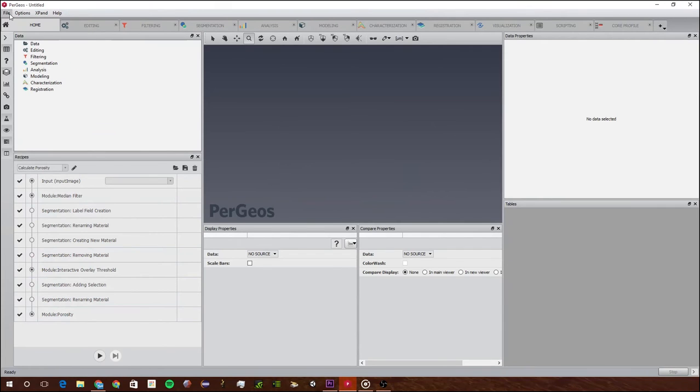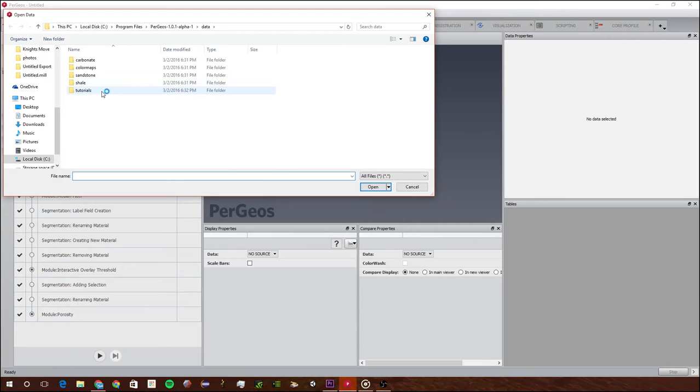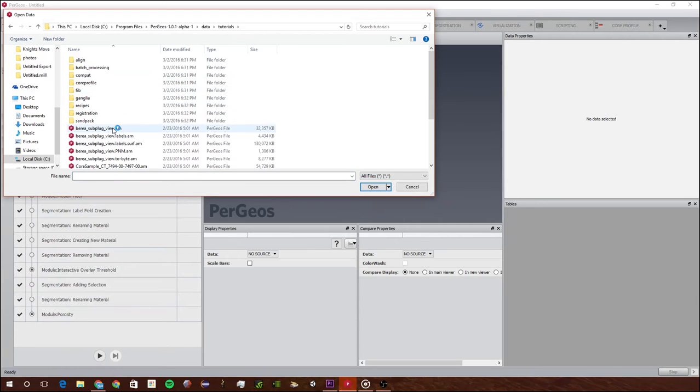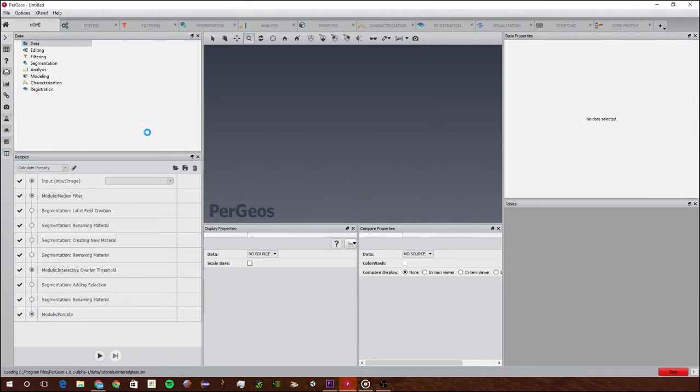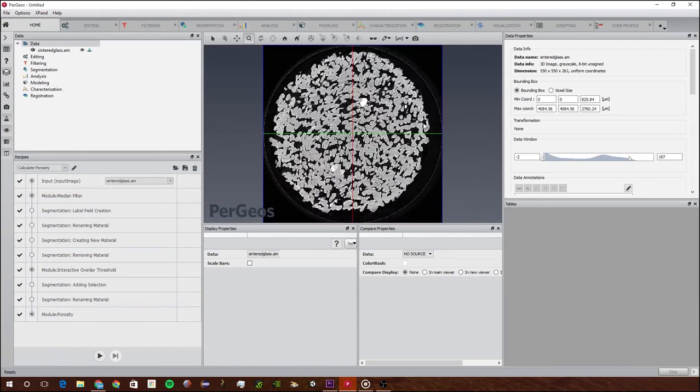Now I'm going to open up some new data. We're going to go up here, click on open data, go to tutorials, and go to centerglass.am.